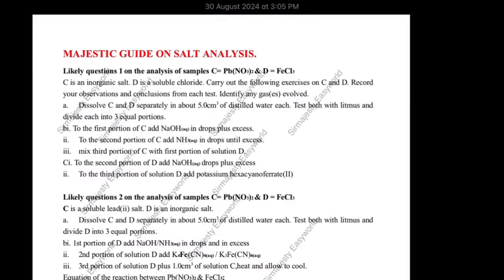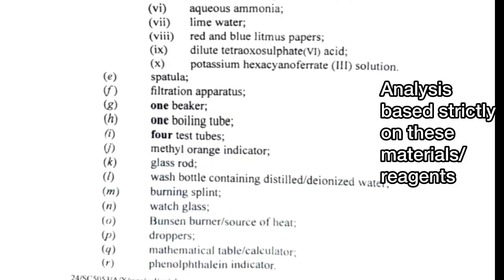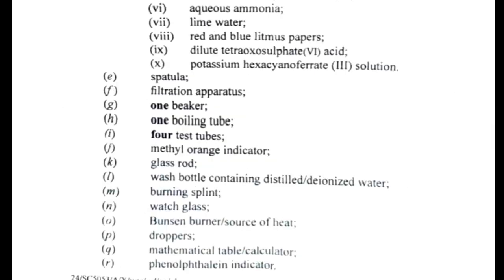Okay, so I'll follow the instruction, and let's make a table first. Remember, we have to have test, observation, and inference on our table. So, our table, yeah, we got a ruler.